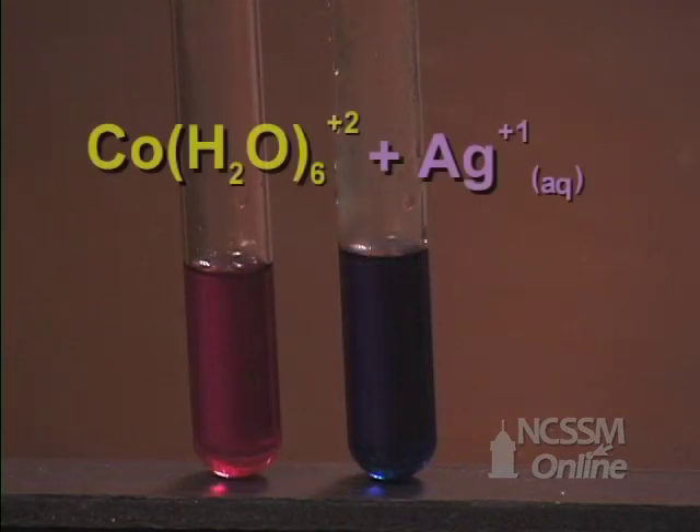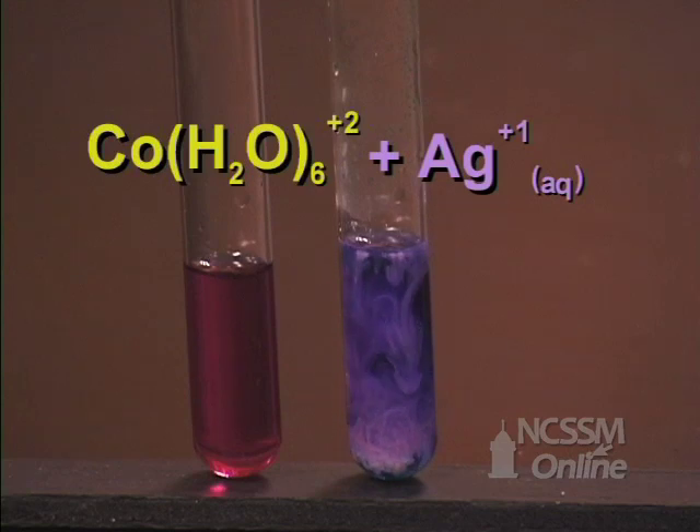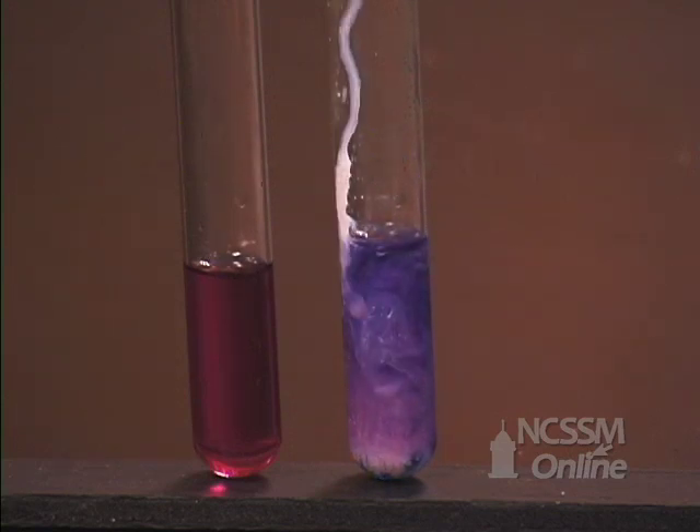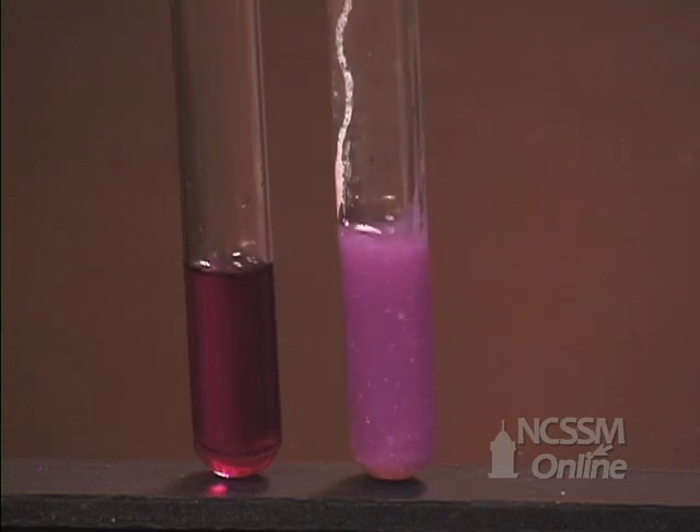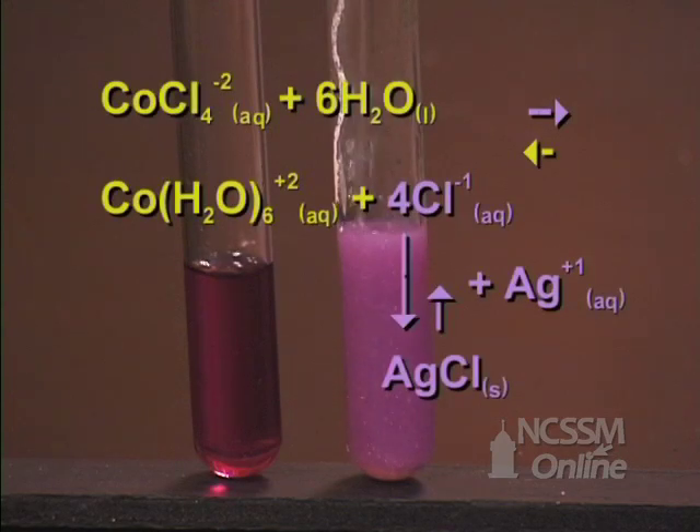We will now add some silver nitrate solution to the cobalt chloride complex ion. We notice the formation of a white solid, which is silver chloride. We also notice that the solution has turned from blue to pink. The silver ion removes chloride ion from solution as solid silver chloride. The equilibrium shifts in the forward direction to try and replace the chloride ion that has been removed.